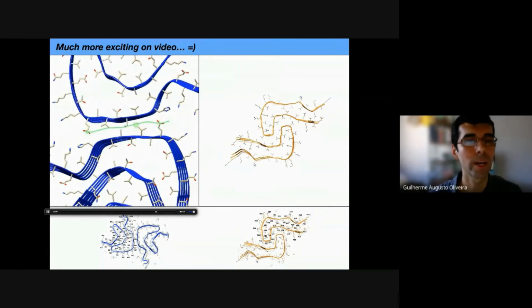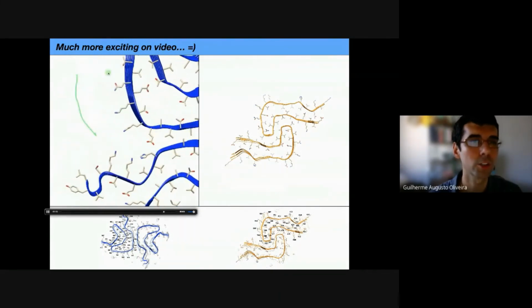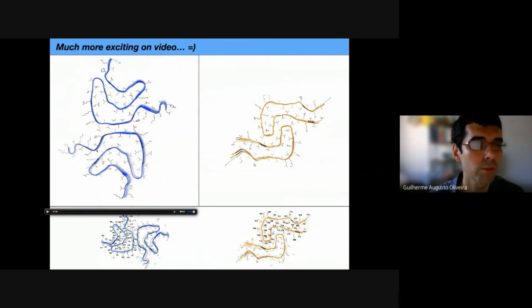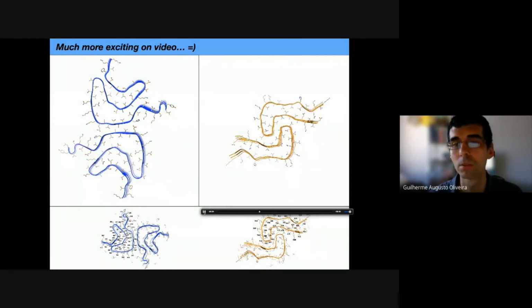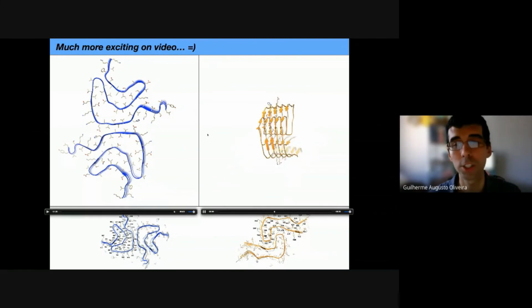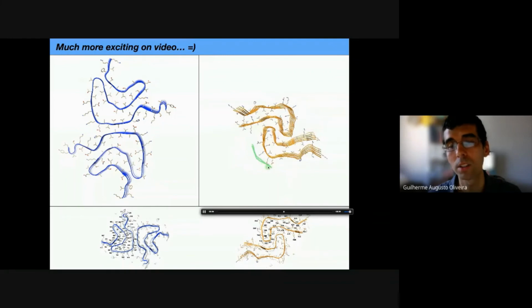Most of the residues in here are short side chain and hydrophobic. There is a charged outer surface of the fiber that is pretty much charged residues. So this is pretty cool. It's a high level of detail, and we can better understand how the fibril is packed together with this level of information. And also the L-shaped polymorph, the twist polymorph, we have some differences. It's an L shape, not an omega shape. You also have a charged residues outer surface in here.